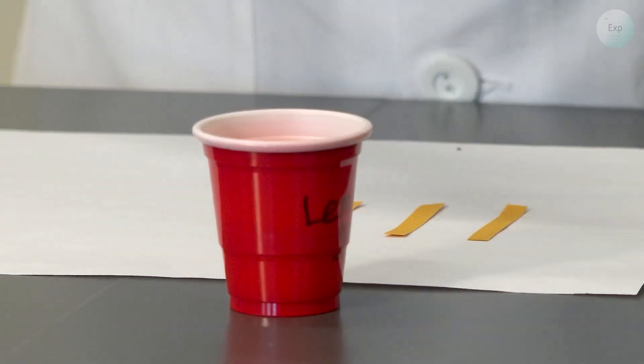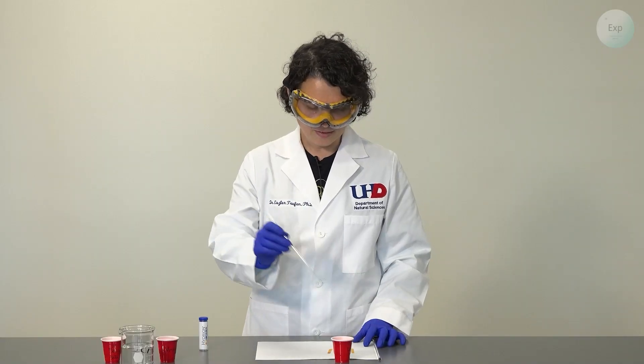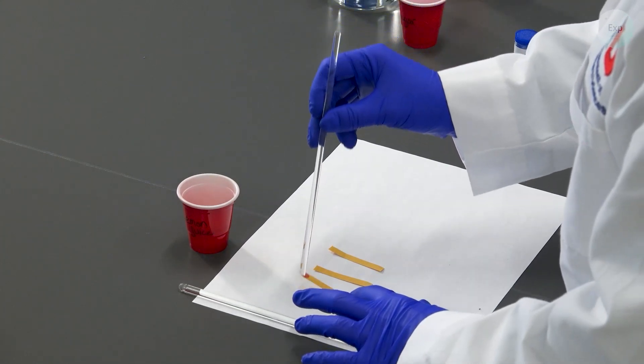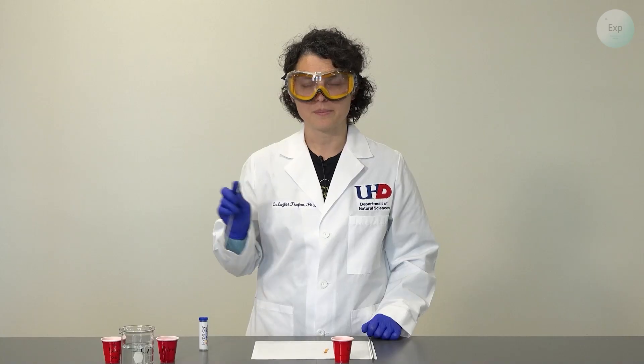For the first measurement I'm going to take my glass stirring rod, dip it in the lemon juice, extract it, and then place one dot on the pH paper.